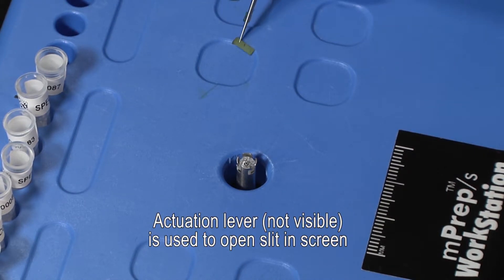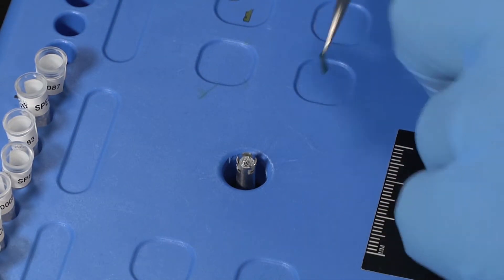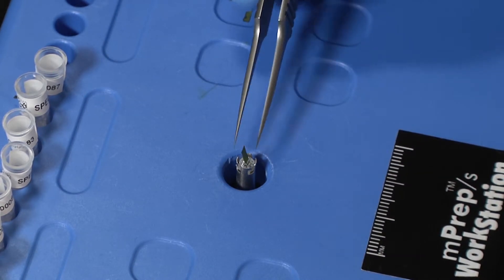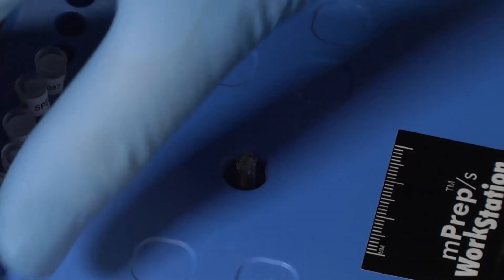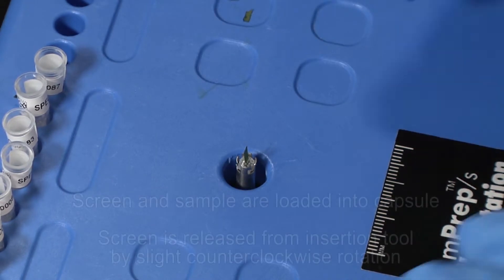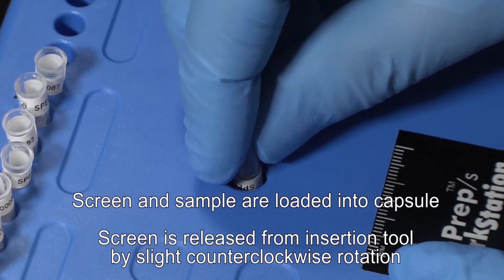Pressing the actuation lever opens the screen slit. The sample is then inserted and the lever released to clamp the specimen. An empty capsule is then placed over the insertion tool, rotated counterclockwise to release the tabs and then lifted off.